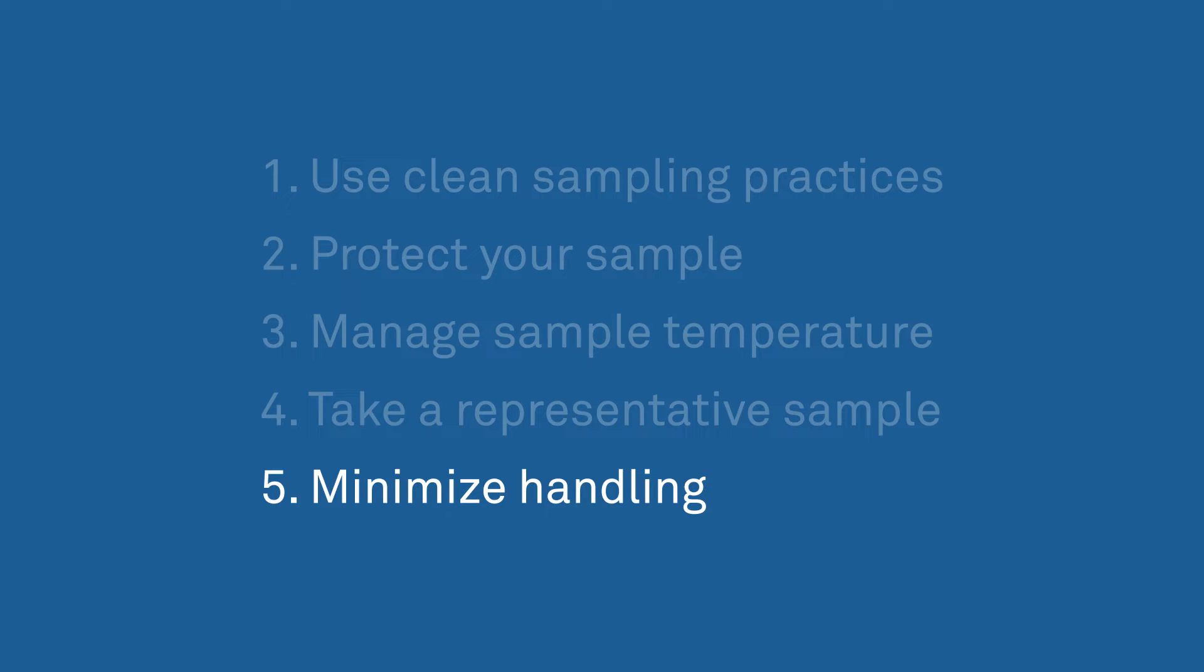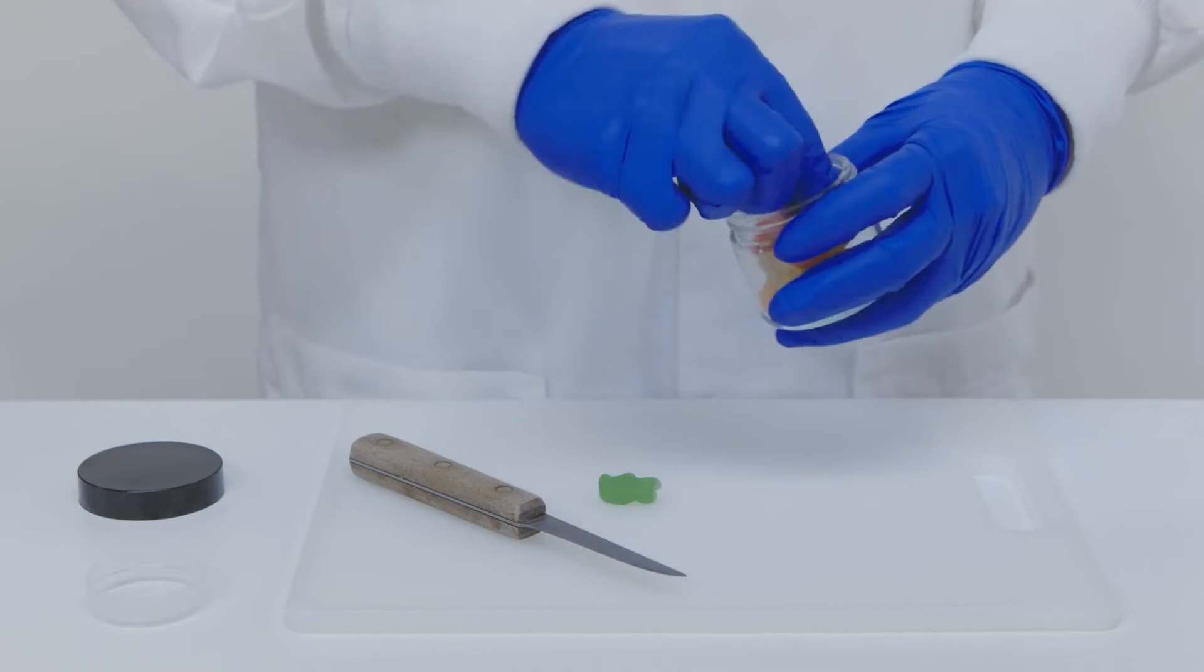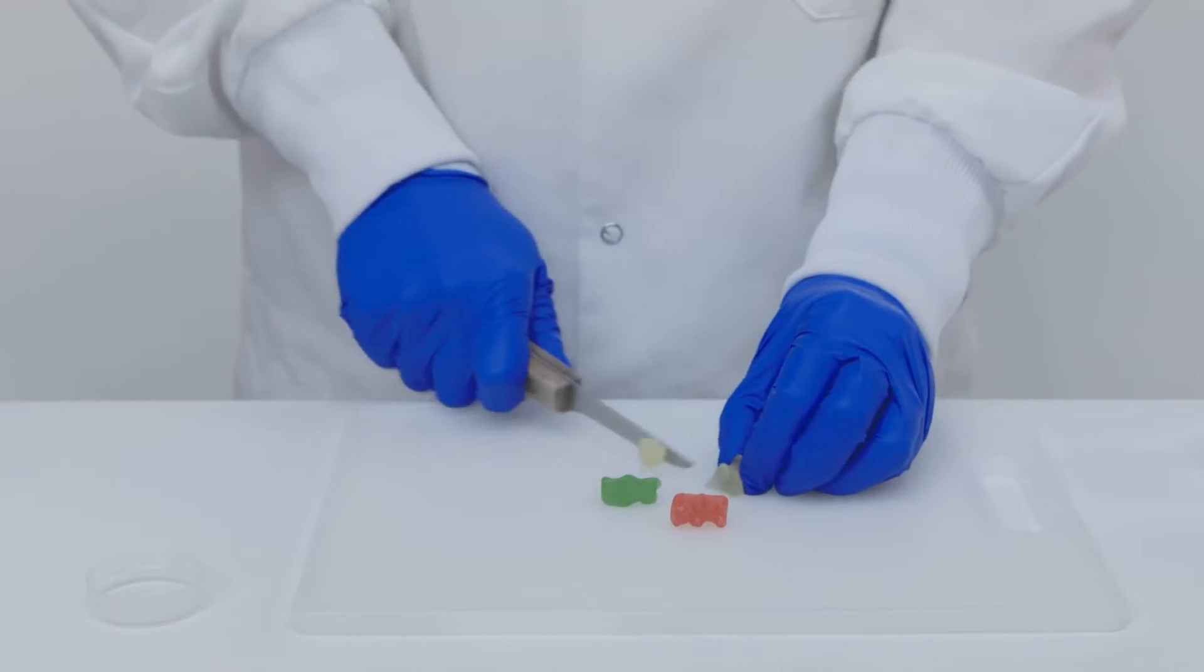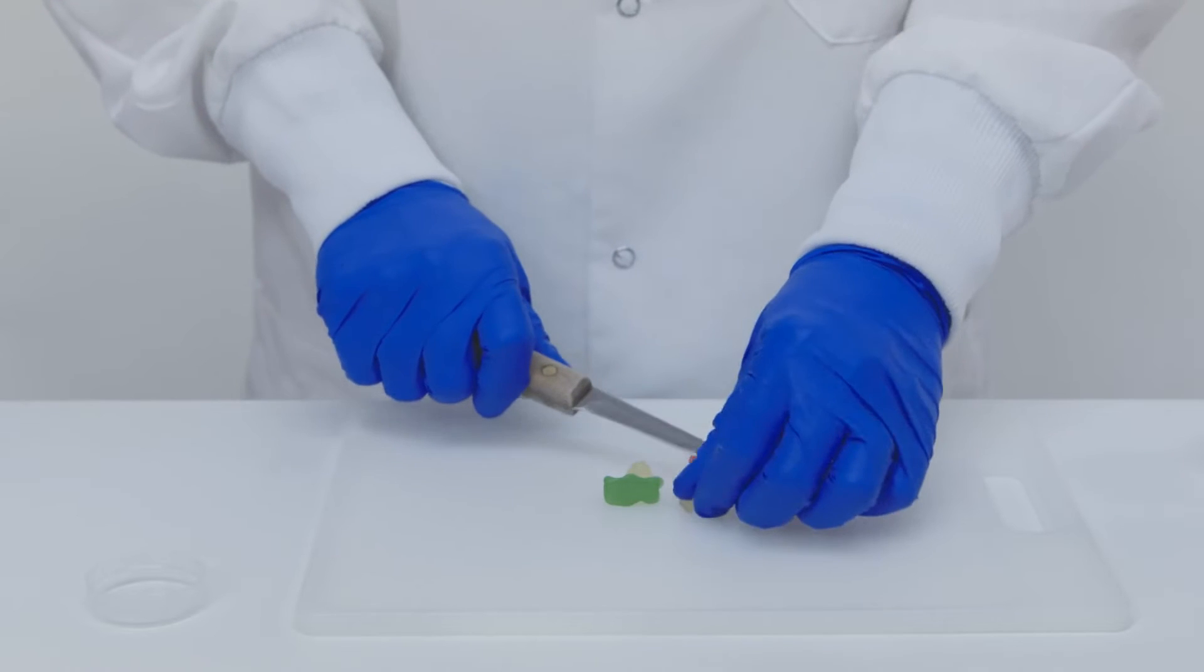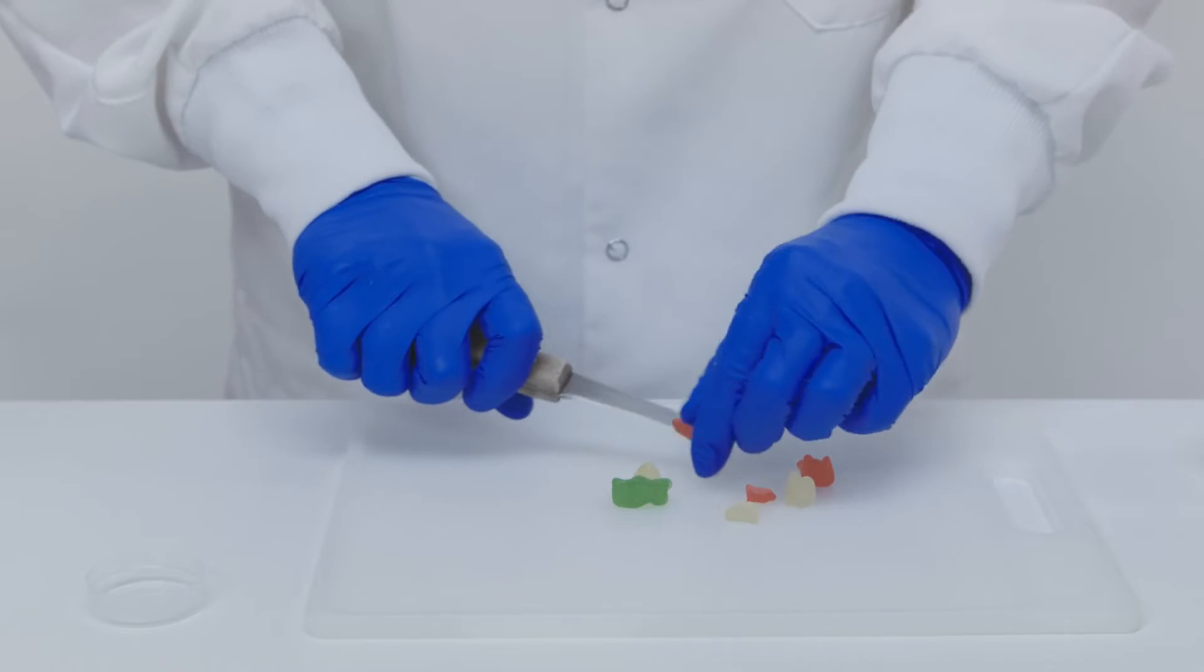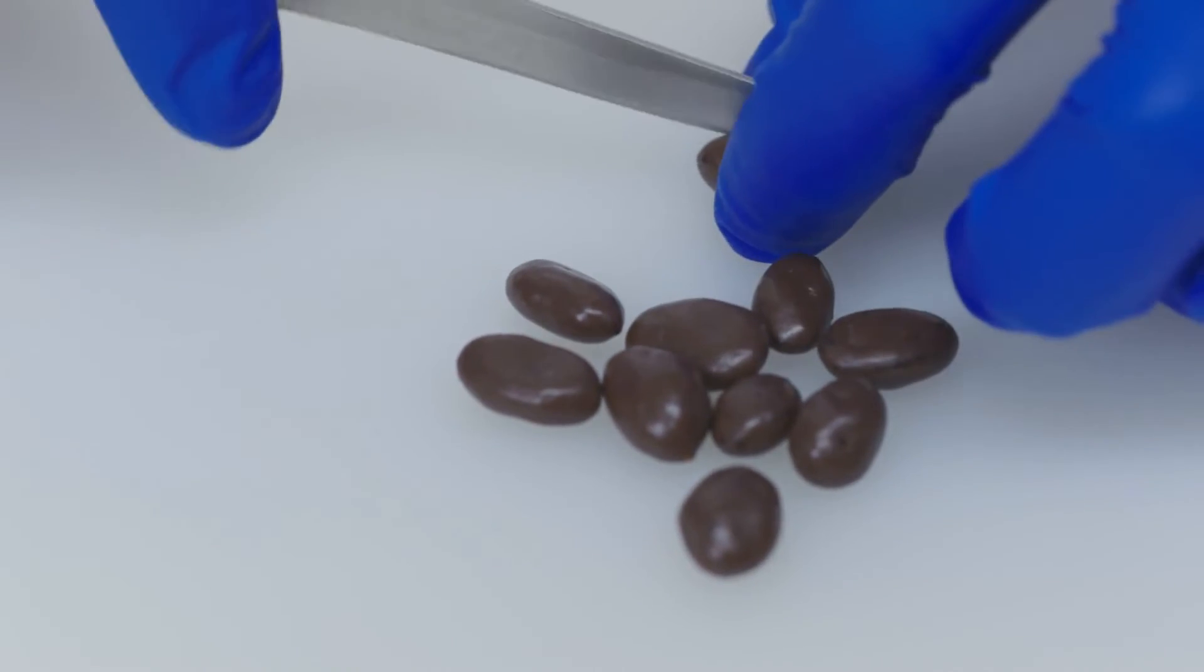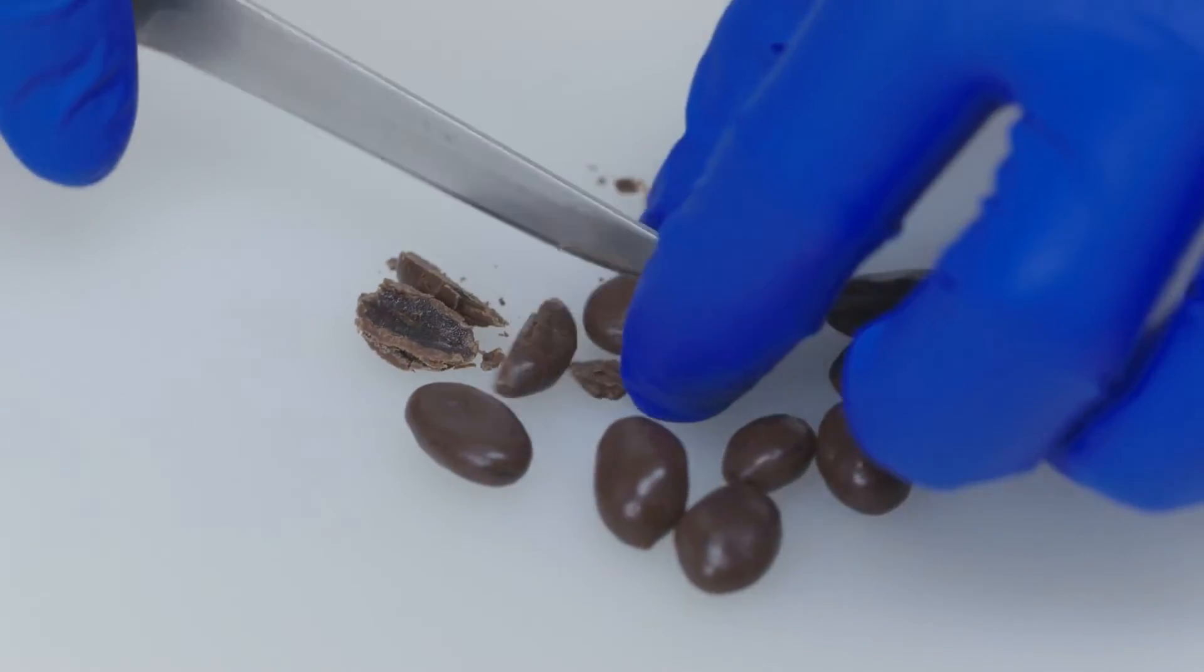Minimize handling. In sample preparation, less is more. We've seen customers use all kinds of sample prep methods over the years, including grinders, food processors, and blenders. There are two problems here. First, the friction of the grinding process heats the sample, driving off moisture and changing its water activity. Second, the increased surface area means that the product loses or gains moisture more quickly, making it more susceptible to the effects of room humidity.